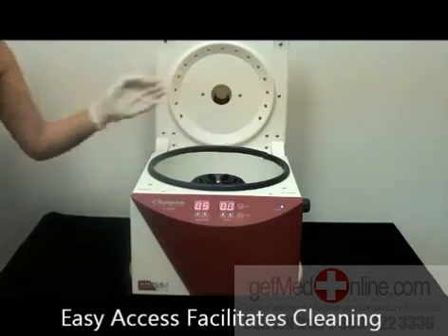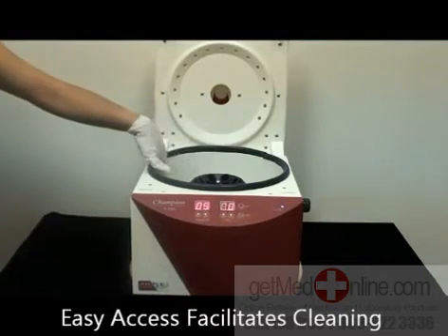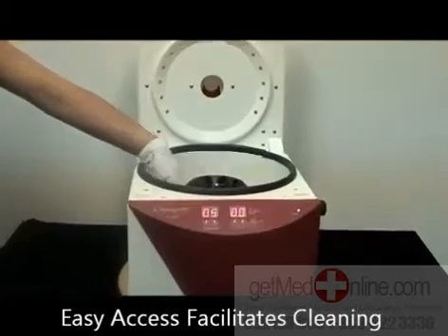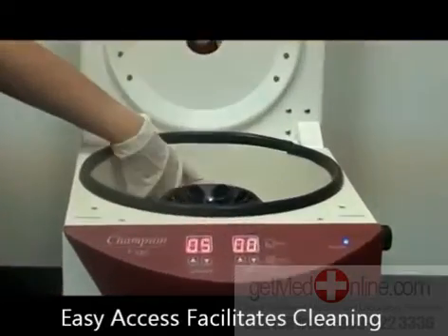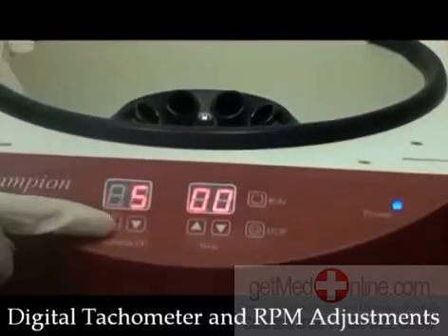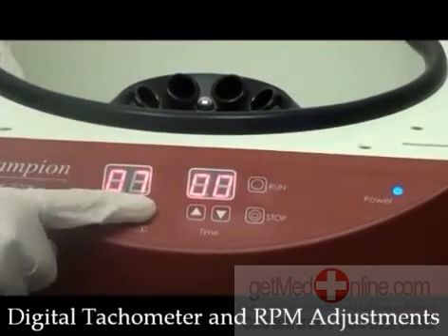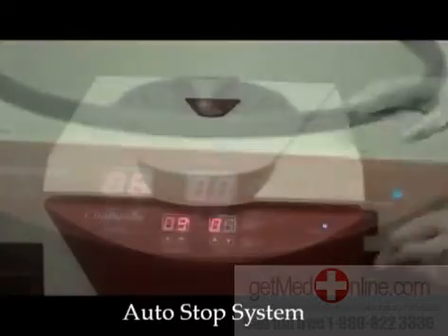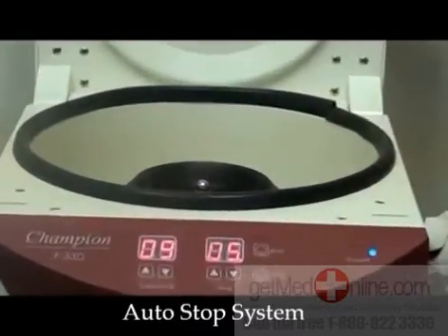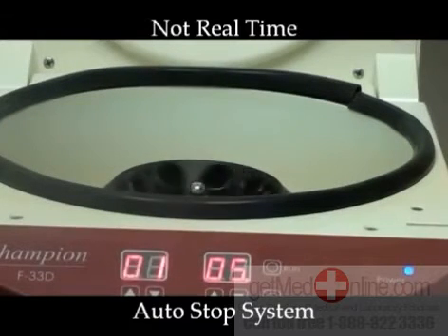The wide mouth opening allows easy access. While closed, the inner chamber and brushless design facilitates cleaning and maintenance. The digital tachometer and RPM adjustments allow precise speed control. It has an auto-stop system that automatically decelerates when the lid is unlocked.